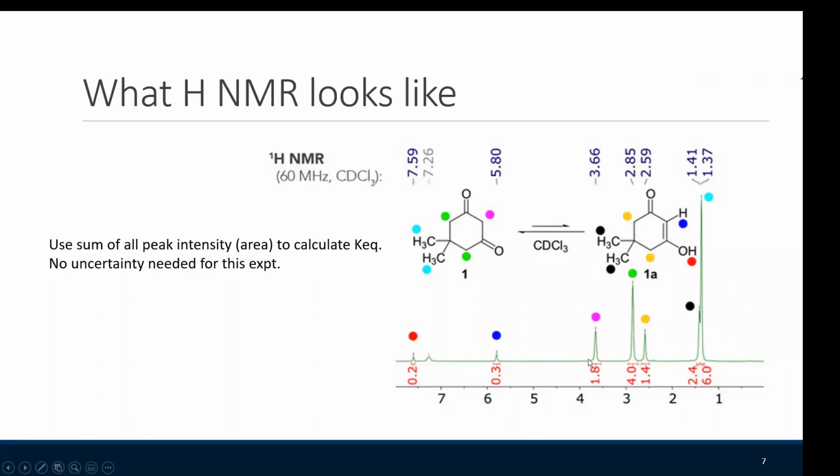When you do the peak area calculation, for example for the pink one, it's really easy, right? You click here and click there, and it gives you all the area in between. And for this peak, where do you go? You can't tell where the black peak tails off. So what do you do with this one?